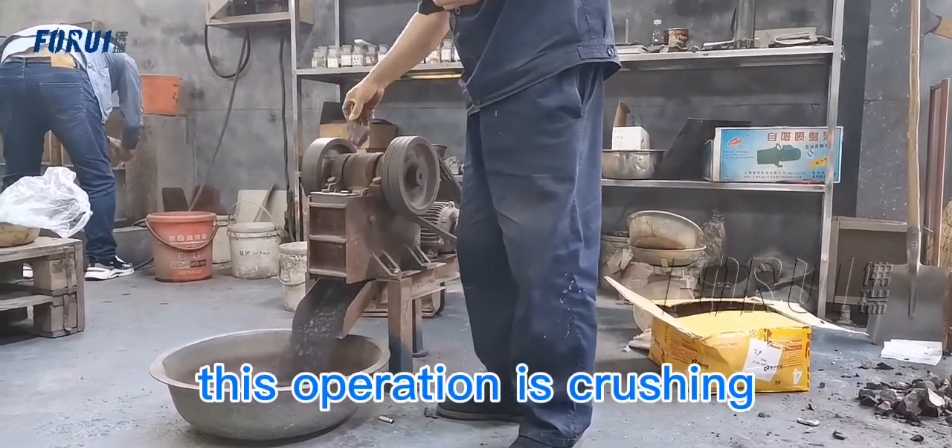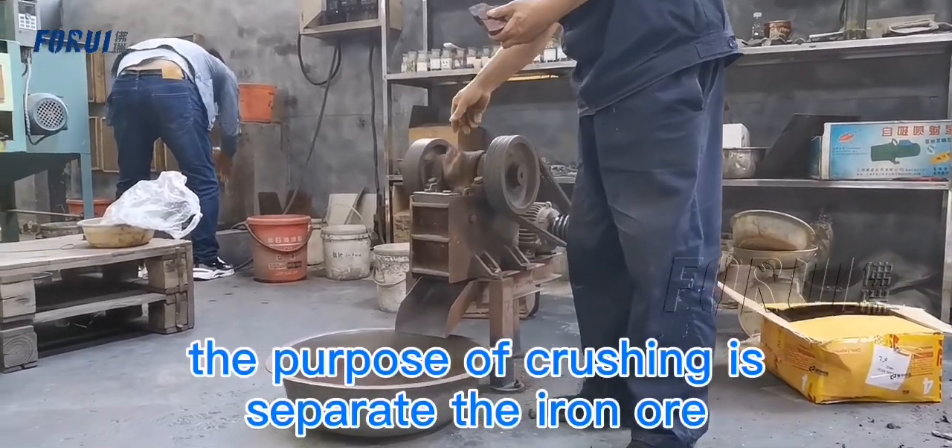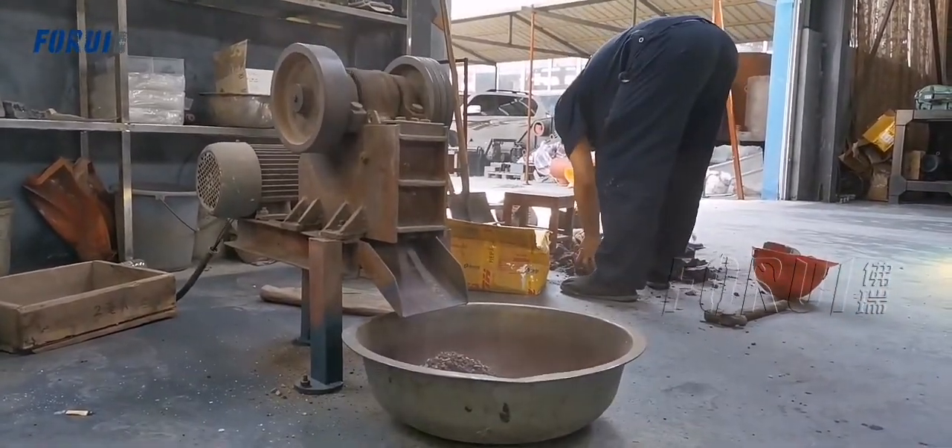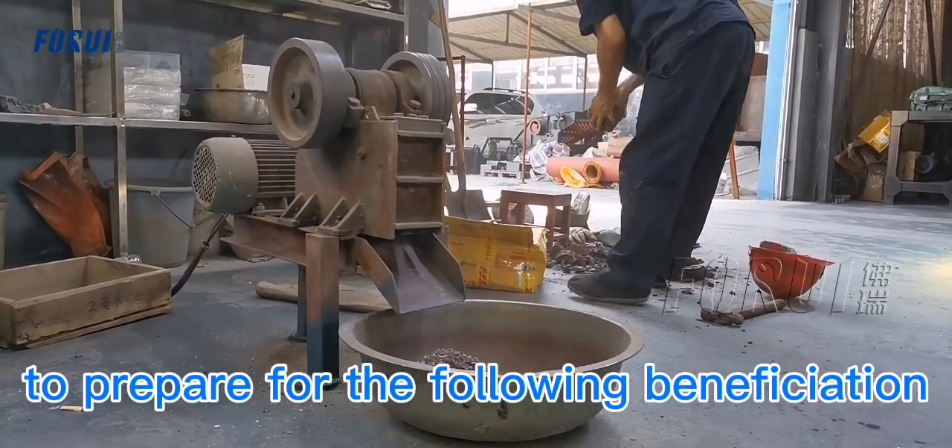This operation is crushing. The purpose of crushing is to separate the iron ore from the gangue, to prepare for the following beneficiation.